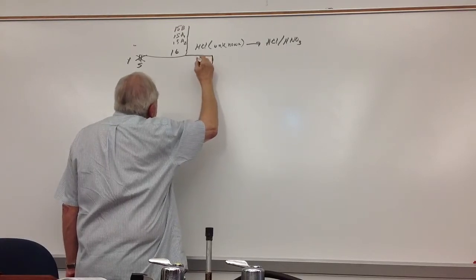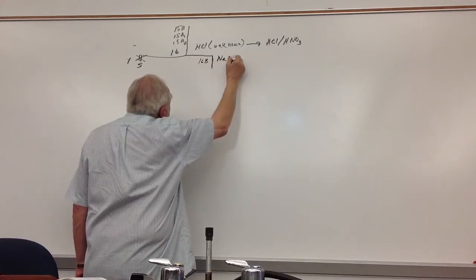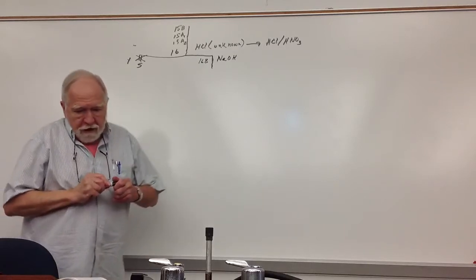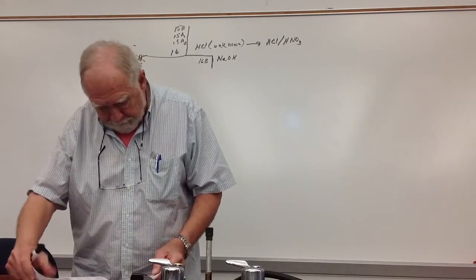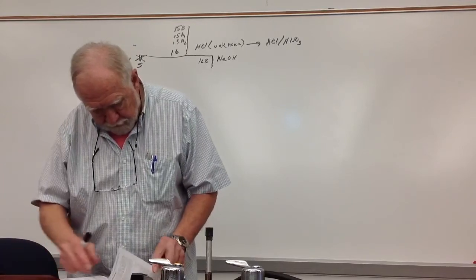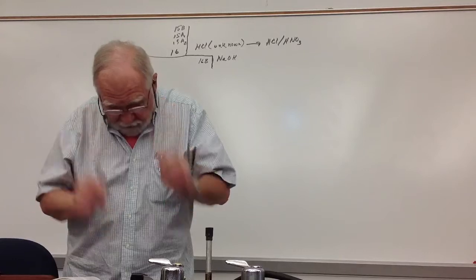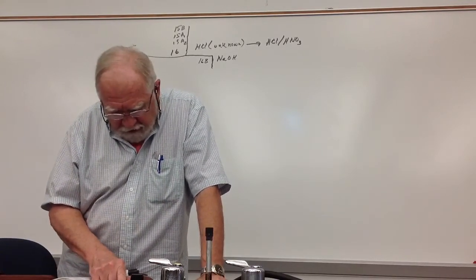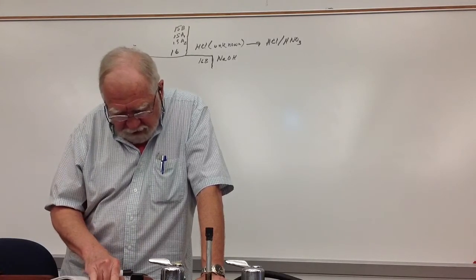And then you're doing 16B, sodium hydroxide. And there's one thing I do want to point out to you in here. I forgot to do that last time. But midway through the procedure, it says, after you've added the sodium hydroxide, you made it strongly alkaline with 8 molar sodium hydroxide.